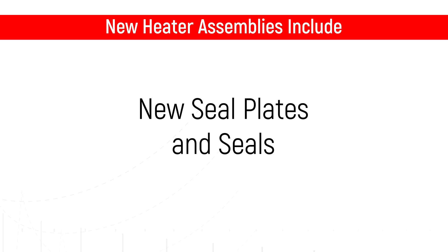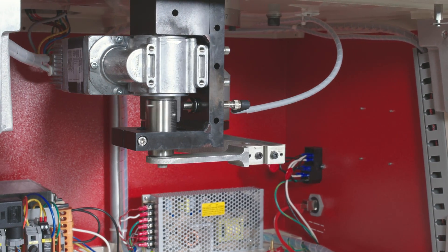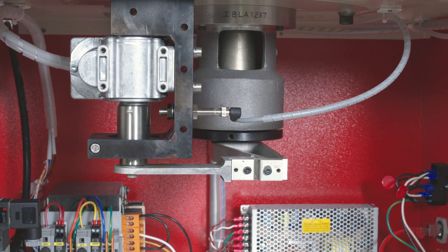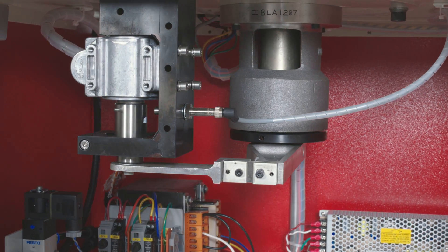New seal plates and seals are then installed in the outer platen assemblies. A new Montec motor assembly is then installed, including new rigid C frame mounting, eccentric, bearing and timing circuit. This assembly correlates to better repeatability.